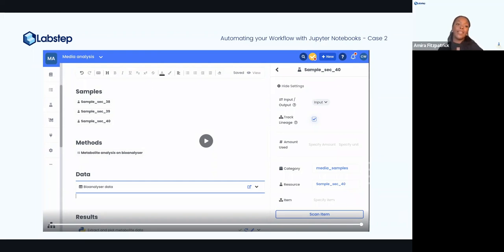Very cool. And I guess one thing that is quite important to a lot of people that maybe want to use this feature is the reusability of it. So is there a constraint on how many times you can run each script? Obviously some people might template these, and could you encourage the script to be used in the template and then keep using the template, or does it have a limit on it?